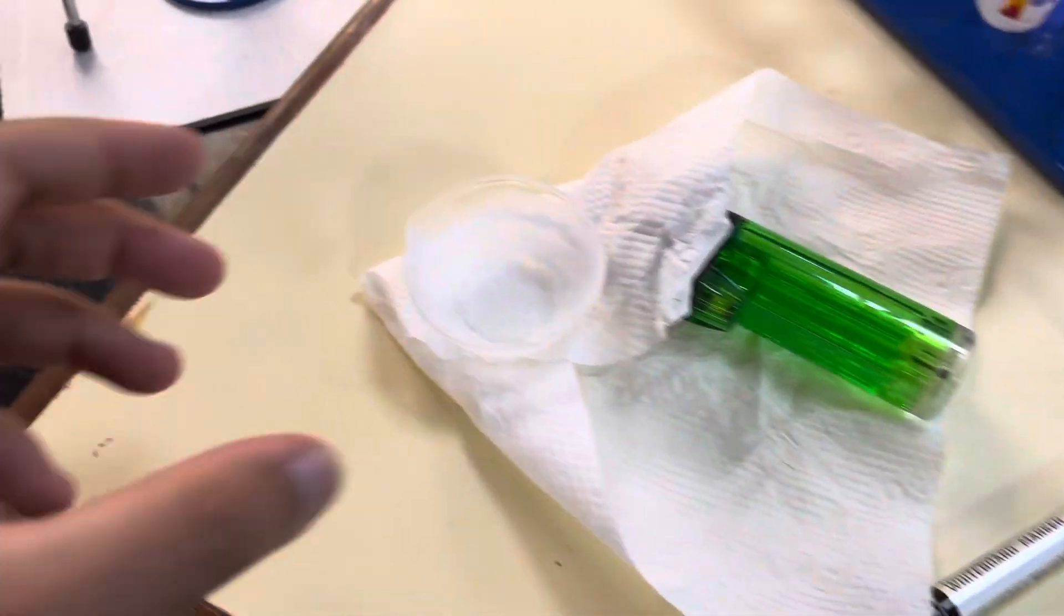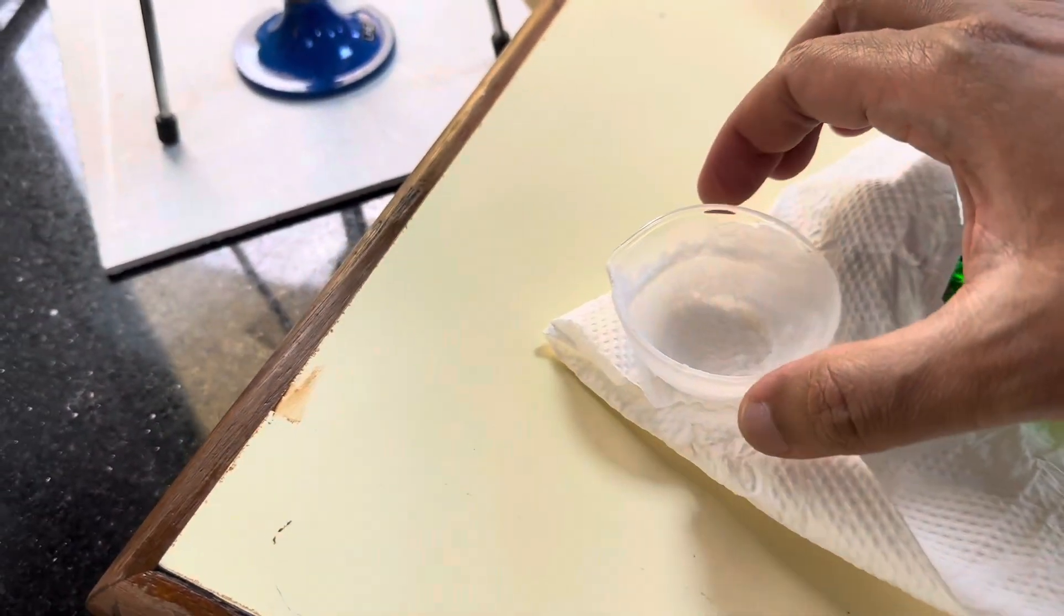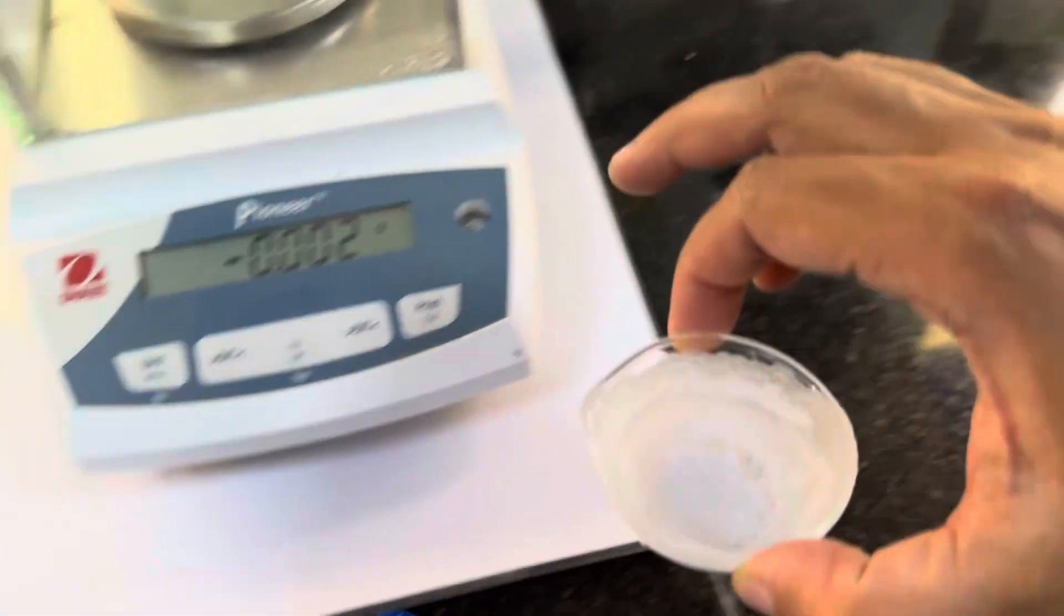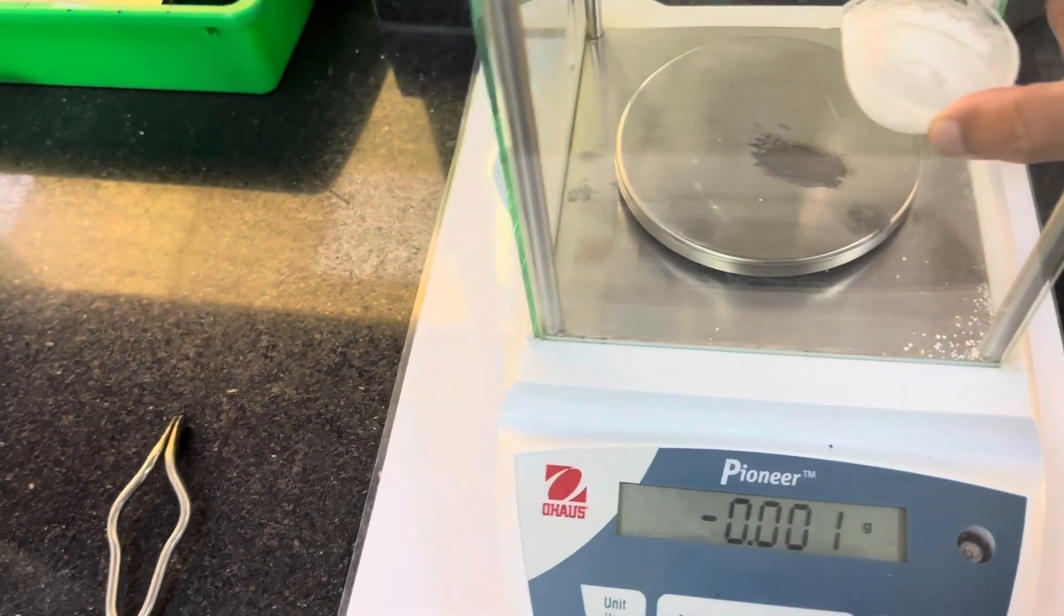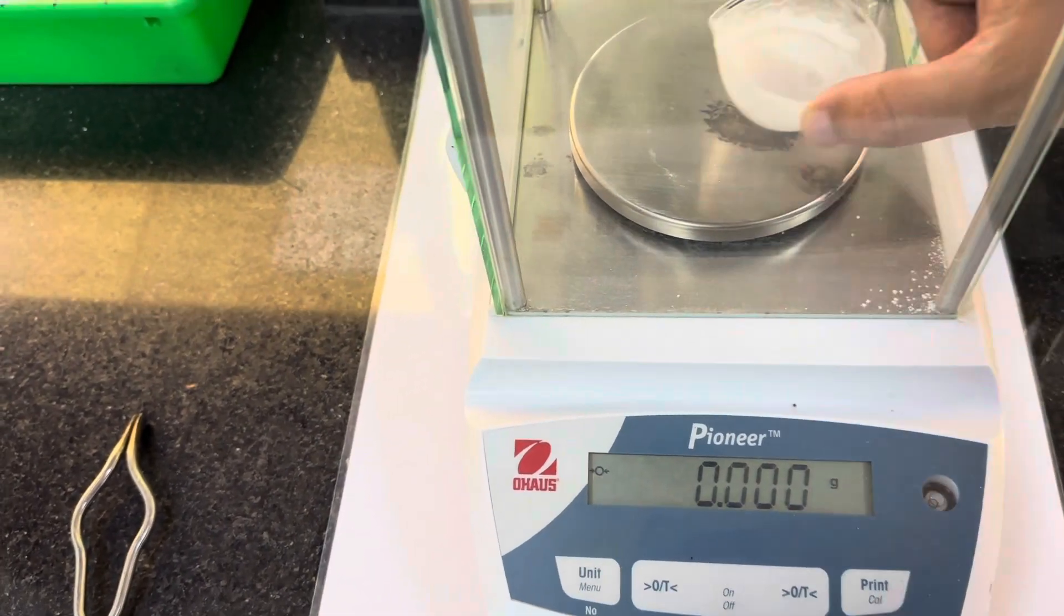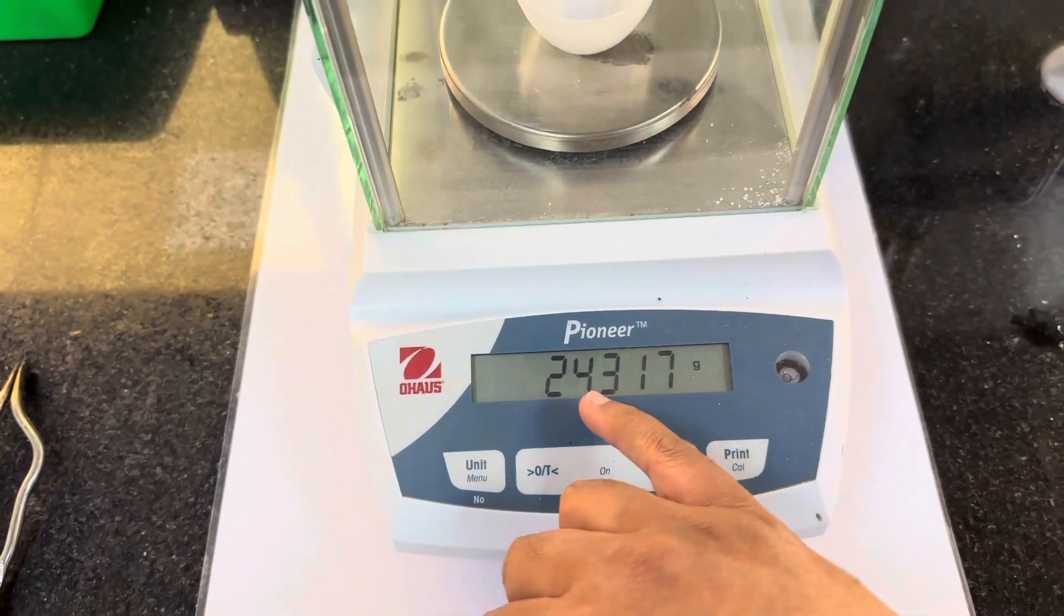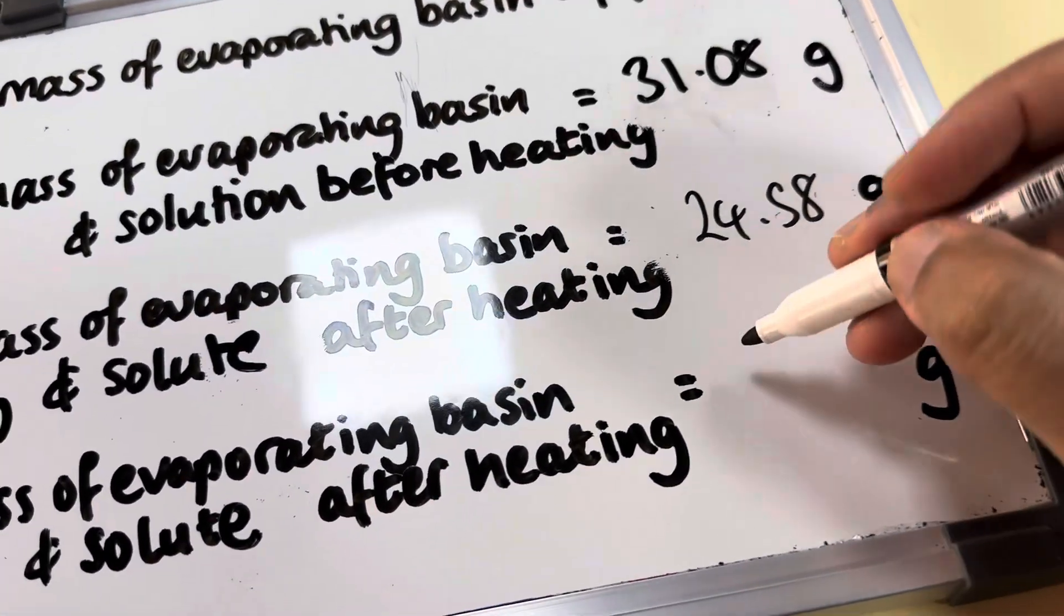This is cooled down now. This is the second time it's cooled down. I've just blotted any extra water off. I'm just going to now move it over here. And this is now 24.32 grams. So it's not gone down by much. I'm going to do it one more time just to see whether I can actually get constant mass. If it stays at maybe 24.3, I'll know that I've done it correctly.